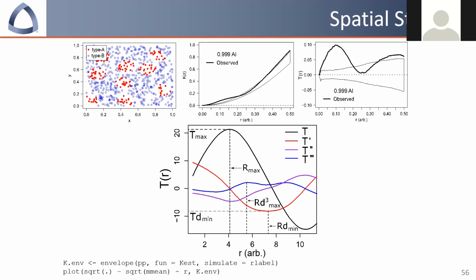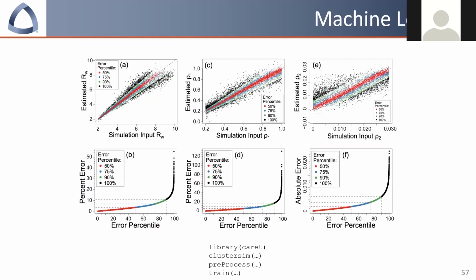But when we do this, we get results that allow us to estimate the radius of those clusters, the density of those clusters, and the background density of those clustering-type points. We can estimate the errors on this based upon our training and test data, so we know that when we state a figure, what our level of confidence is in that figure.